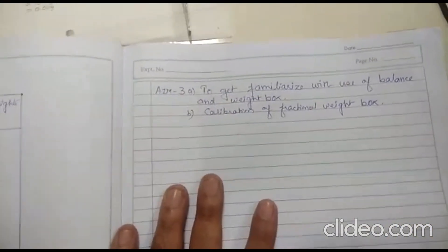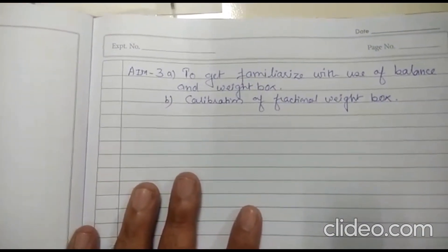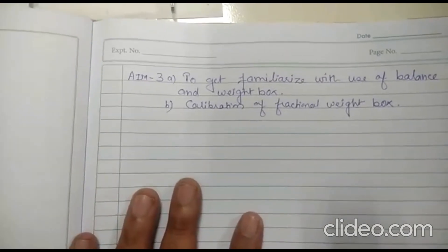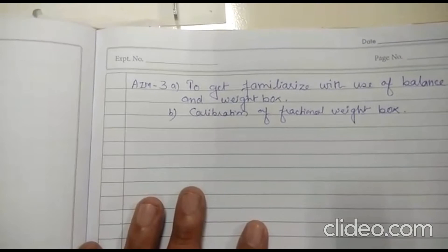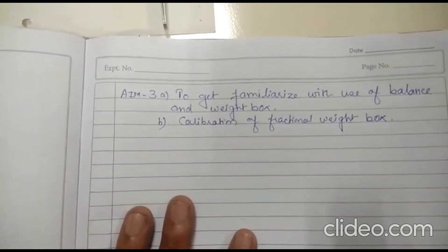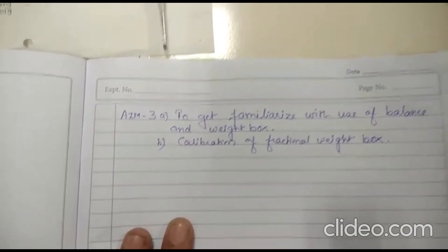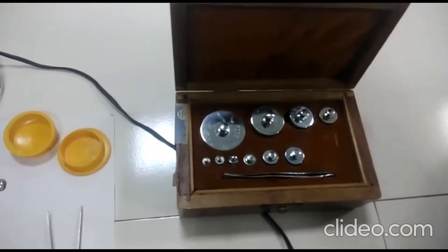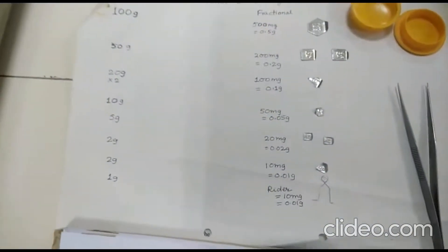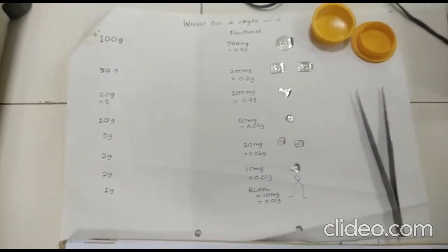Good afternoon. Our objective is to get familiarized with the use of the analytical balance and the weight box, and second, the calibration of the fractional weight box. We have already dealt with the balance and its uses. You can see here this is a weight box and this is a fractional weight box.